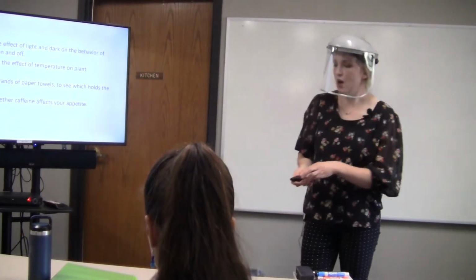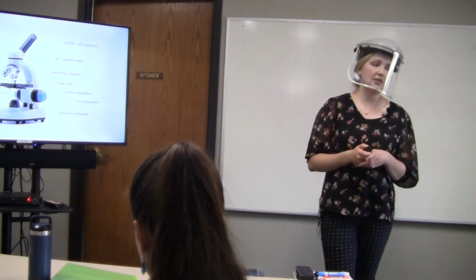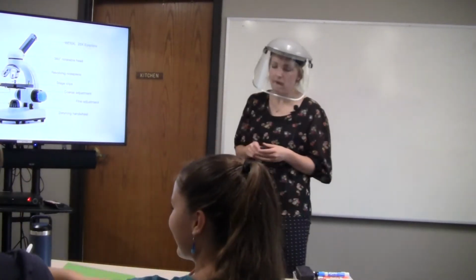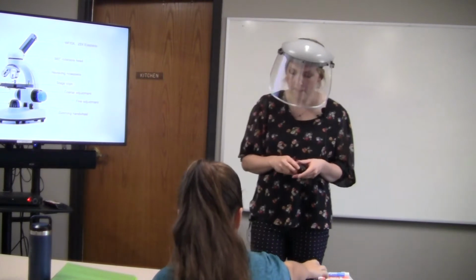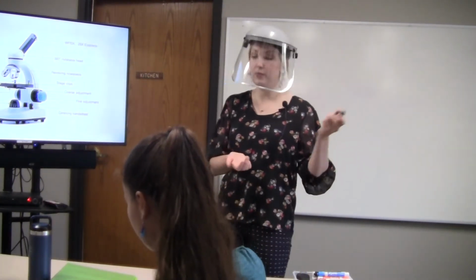Okay, so now let's talk a little bit about microscopes, because that's going to be our lab activity today. We're going to be working with the microscope today.